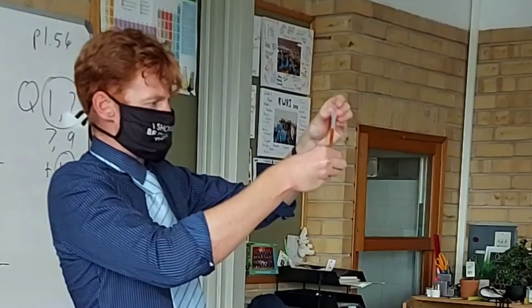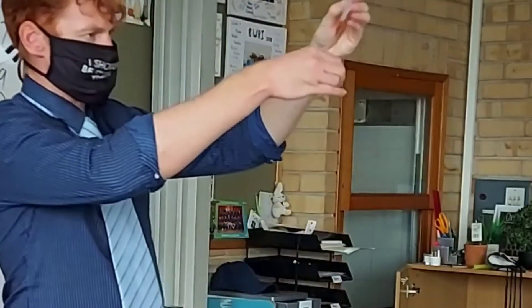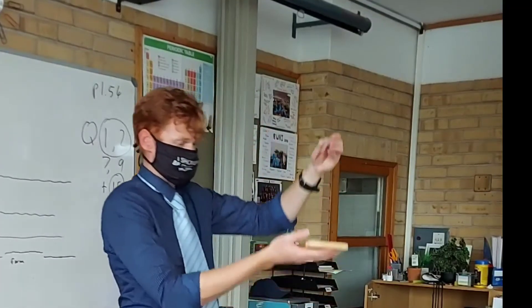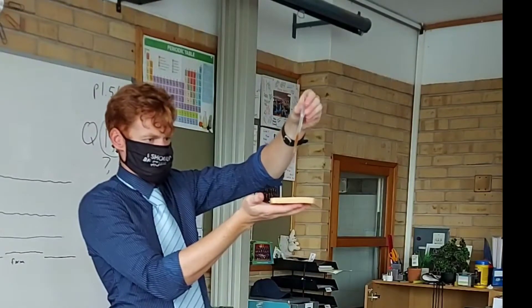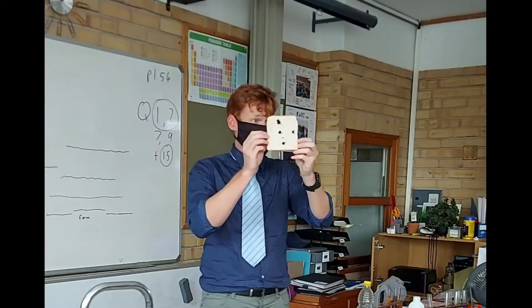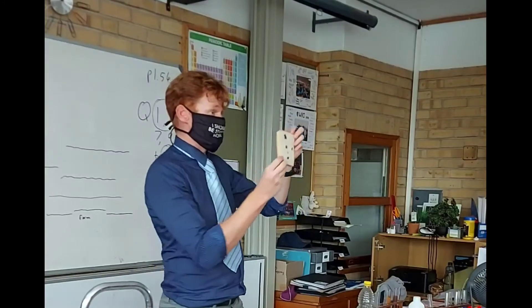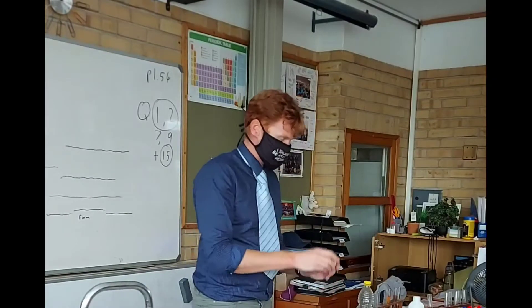The apple. Potato. And then the bread. You can see if you look at the bread, you can clearly see that there is a difference in color — a change to a very dark blue-black. So if it changes to dark blue-black, then we know there's presence of starch.